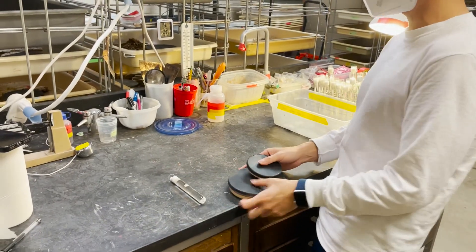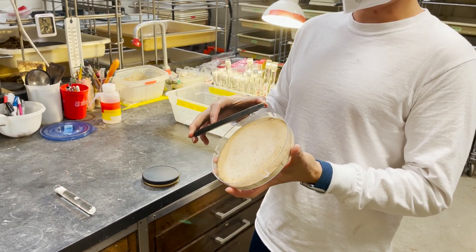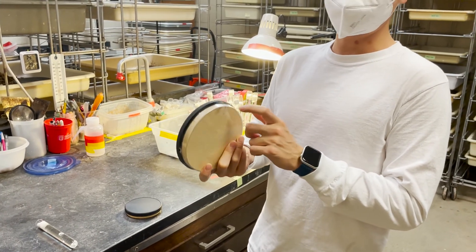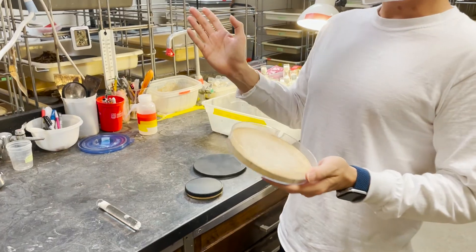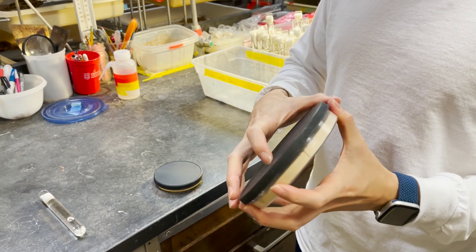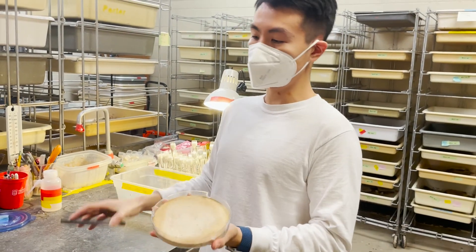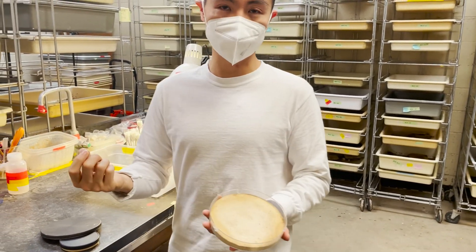We keep them in a nest like this. It's essentially just a petri dish that has plaster at the bottom. The plaster is fused with dental powder so it's stronger than regular plaster. They want to live in soil, but we keep them in a petri dish because it makes it easier for us to manipulate the colony content — if we want to collect the queens, pupae, or other broods, we can pick them easily.